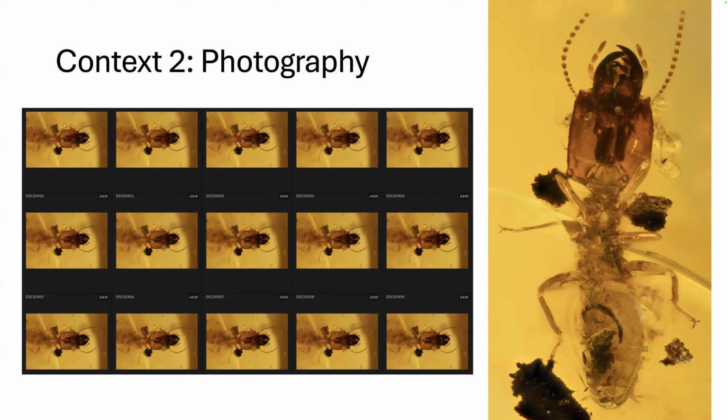So imaging. I said it's not going to be all about microtomography. And I mentioned earlier on my first experiments, 2008 onwards, in making images. The way I used to do it is bring a camera up to the eyepiece of a microscope, focus the camera on infinity, and then focus with the microscope. So just move to each different level where you want something in focus, collect all the images, use stacking software to stack up and have an image that's in focus from front to back.